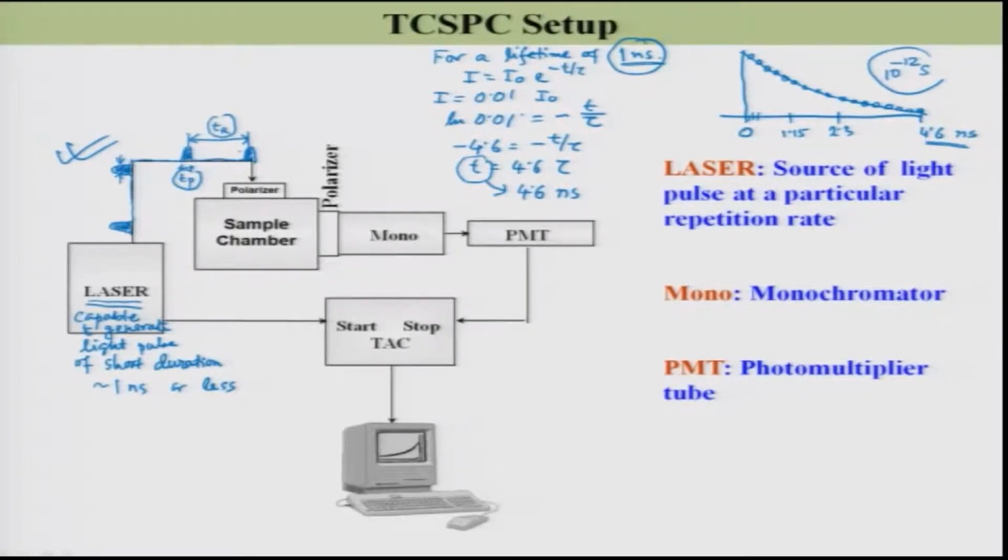And another quantity you also have to define is the wavelength of the light, because you need a particular wavelength for the excitation, lambda.